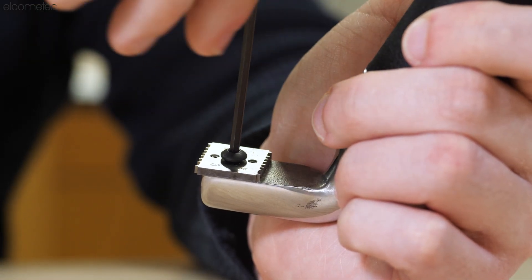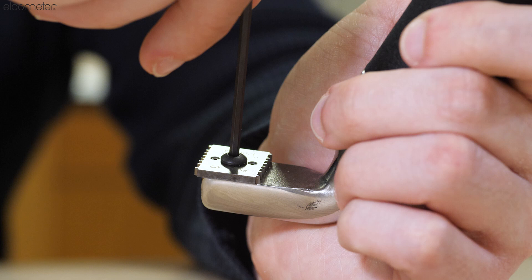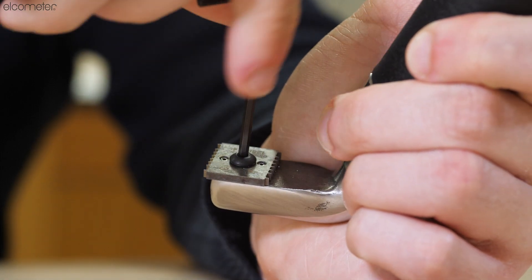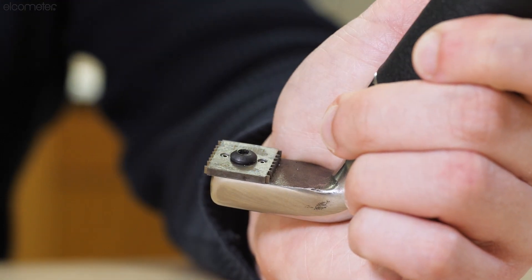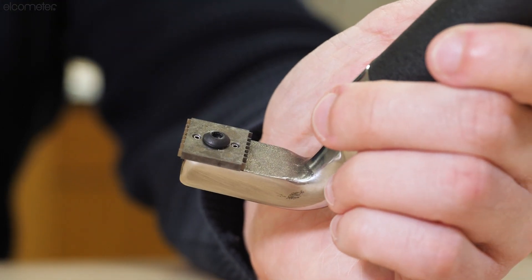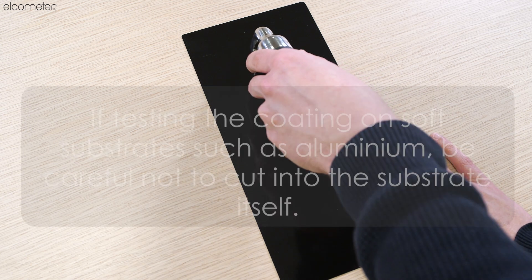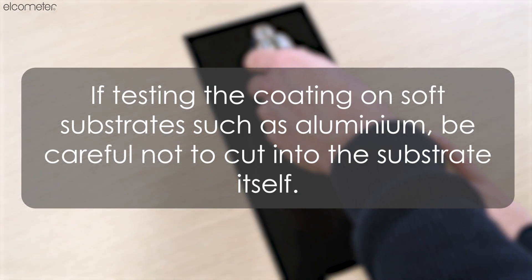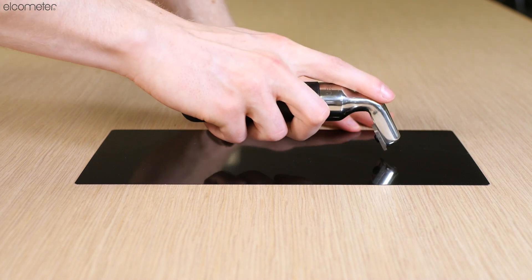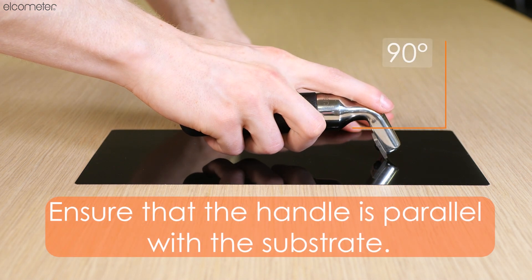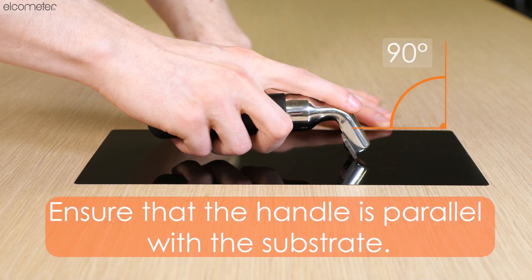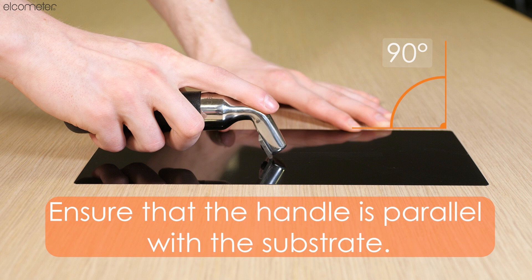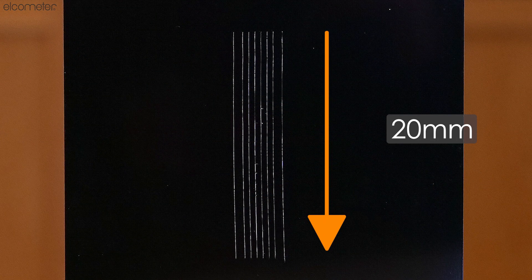Once you have selected the blade which meets your test requirements and fitted it using the hexagonal wrench supplied, you should then place the cutting edge on the sample. Using a firm grip and a steady movement, pull the adhesion tester towards you to make a series of parallel cuts which stretch approximately 20 millimeters in length.